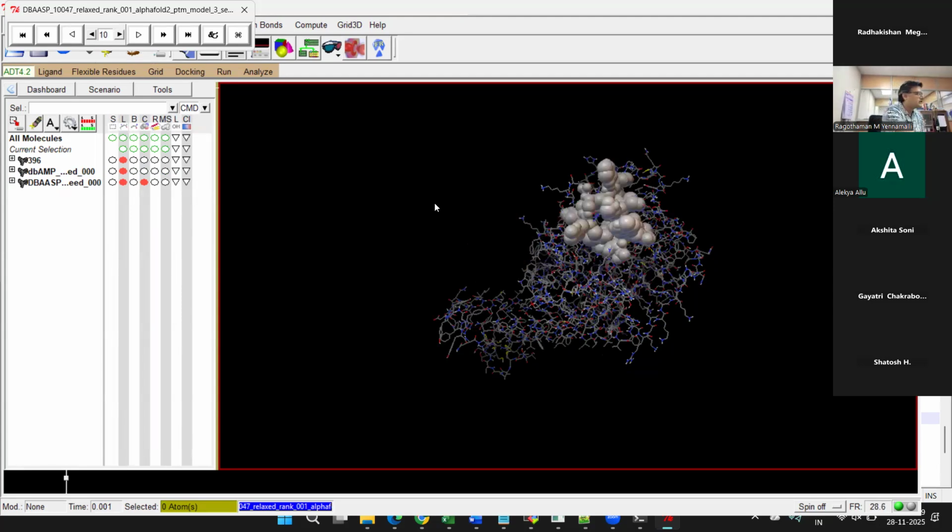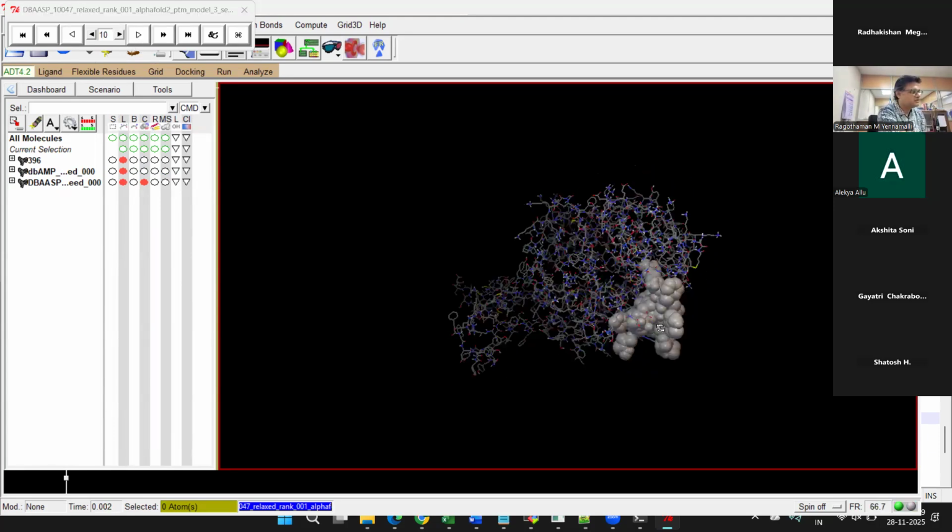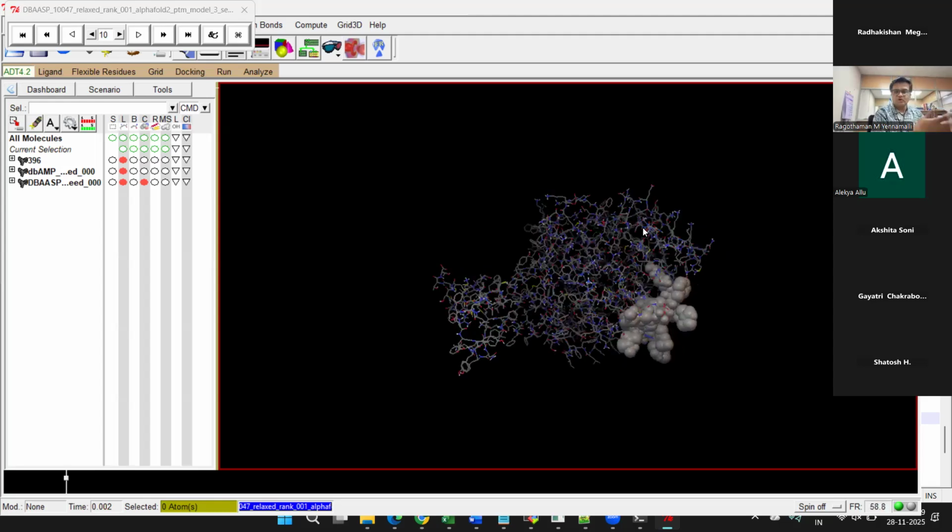Okay, so I can play around, play all the conformations, and one by one, I'll see that when I did a blind docking, there are two places on this protein where the peptide was more happy to bind. Okay, if let us say instead of 10, I did 100 dockings, then I'll have good statistics, where 50% I will see on one side, 50% on another side.